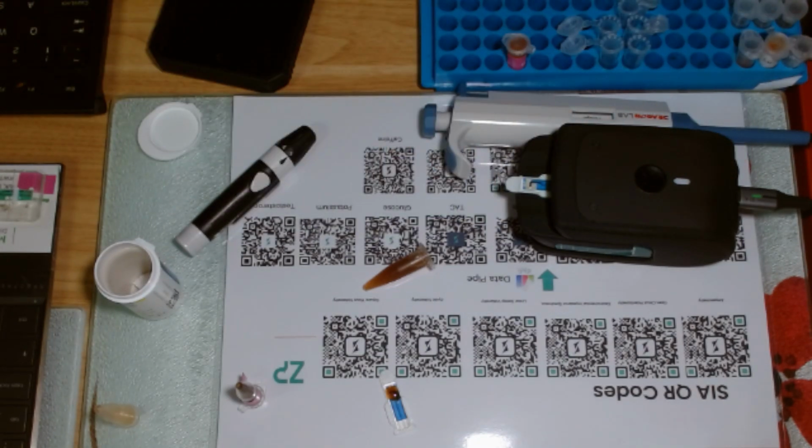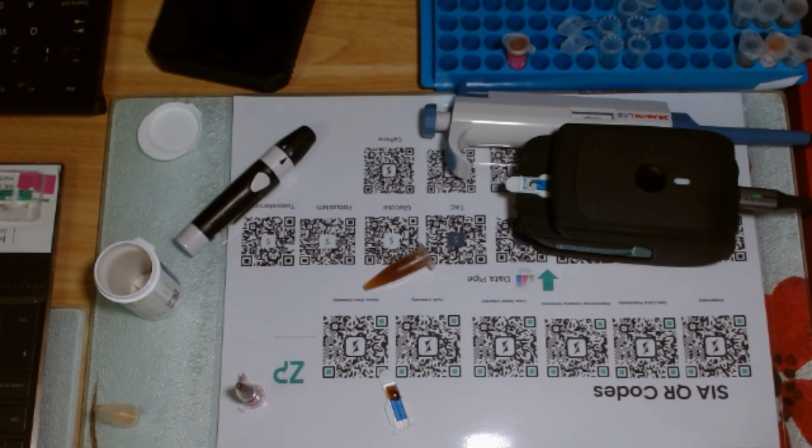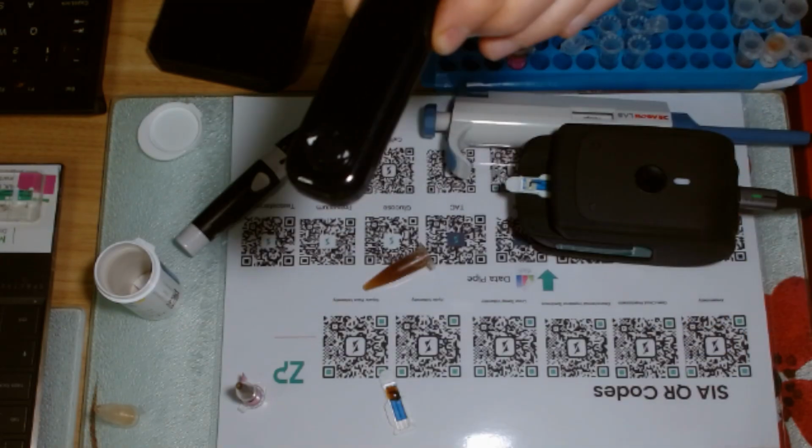So at this moment, we've been validating around samples like this. What we have not been validating around samples like this. And you can't just assume that glucose strip will work in urine. That glucose strip, for example, works in blood.